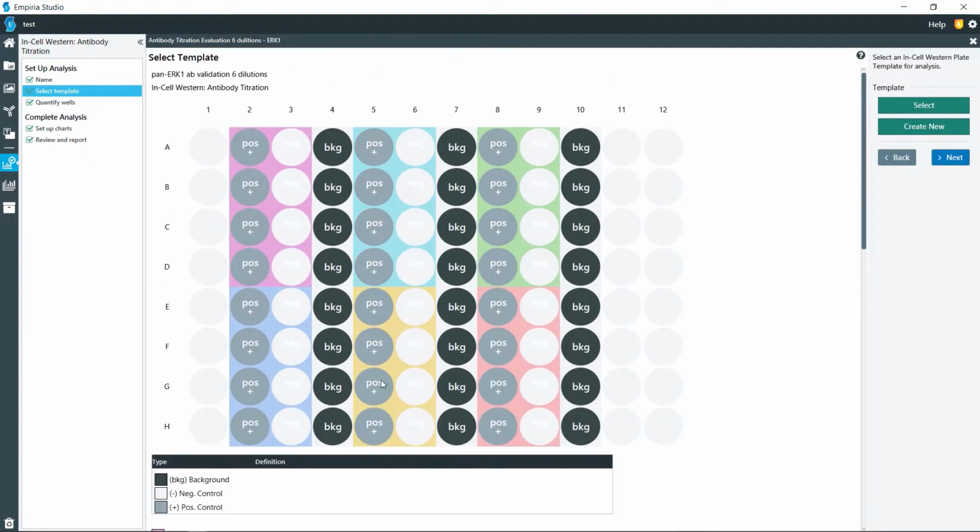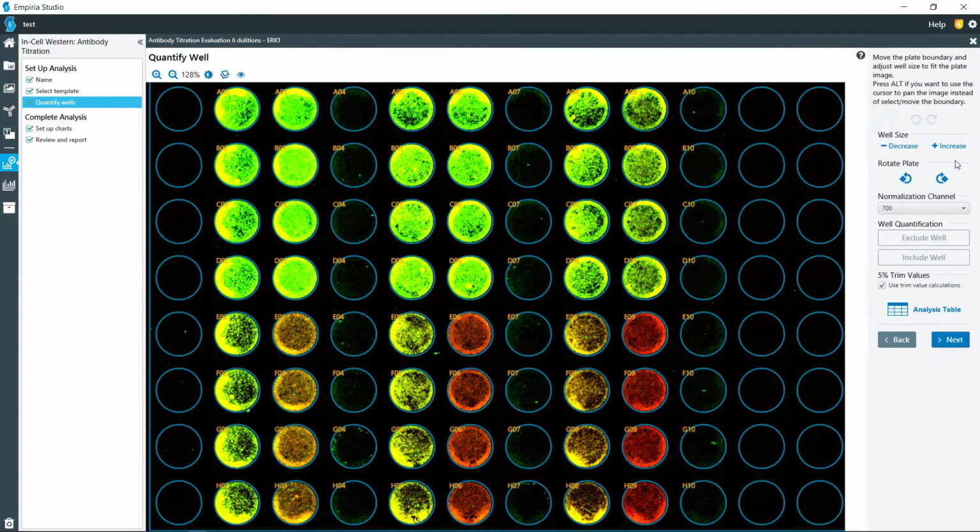We are going to have a separate video for just strictly creating these templates, because this does get a little complex and we don't want this video to be too long. So I'm going to go ahead and use this one right here. I'm going to click on the next button.